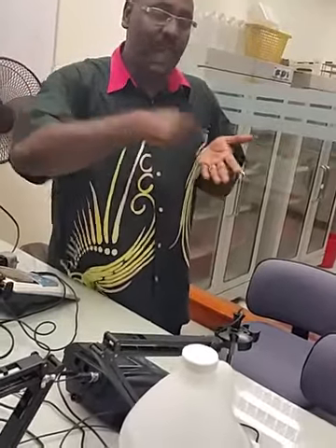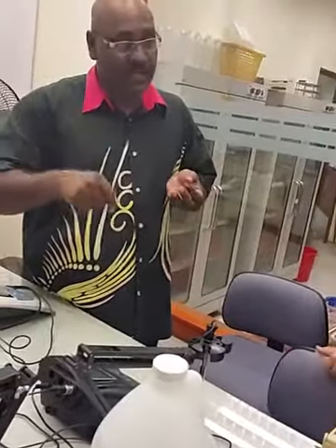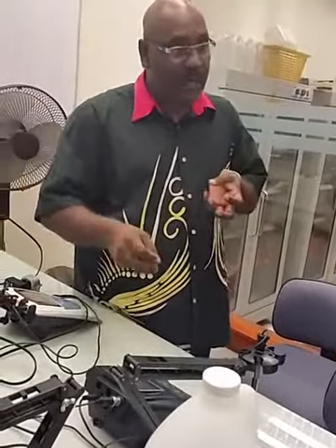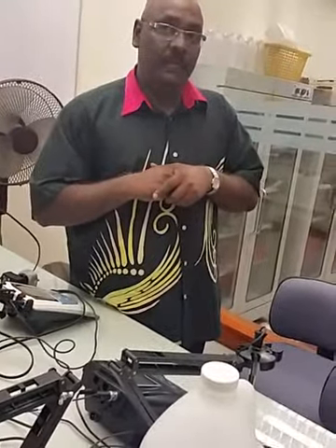So we will have a straight line graph that is called a calibration graph. Your sample must be around this range. When you analyze, if the sample concentration is more than the standard, you have to do dilution. You bring it into the calibration range, then only you can measure.